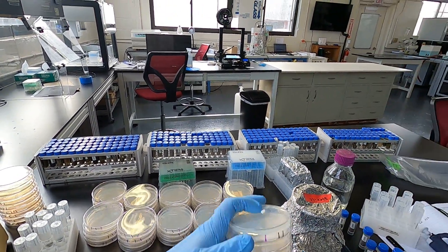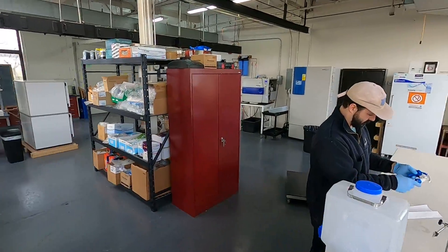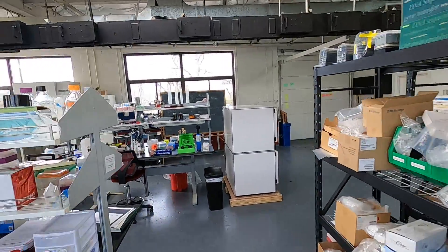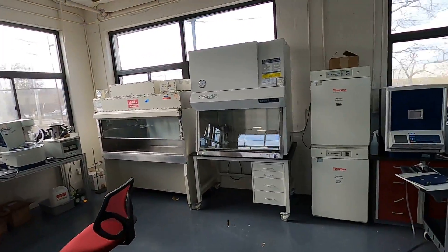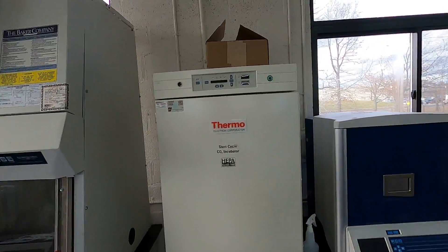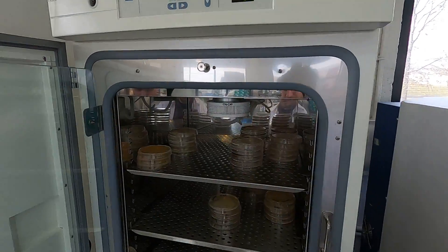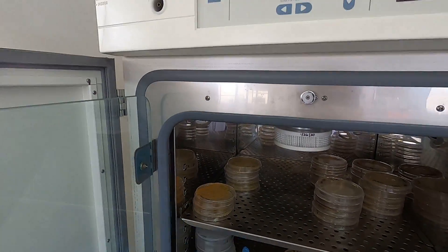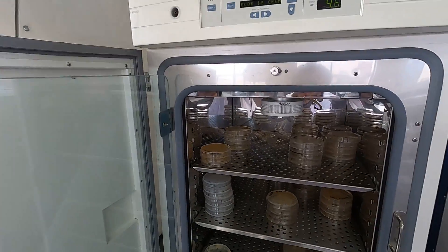Alright, great. Now we have our plates. They're inverted. Bring them to the incubator. This one's at 30 degrees C. See you in a couple days, little buddy.